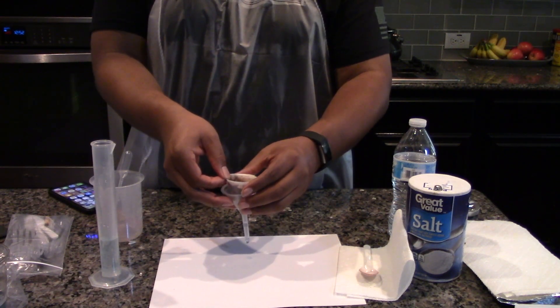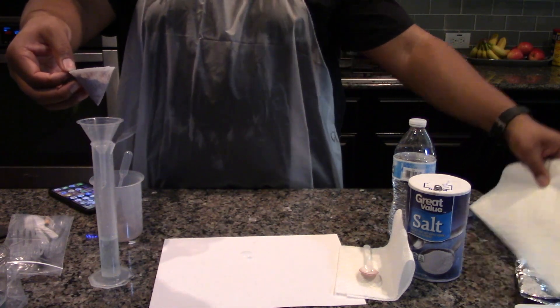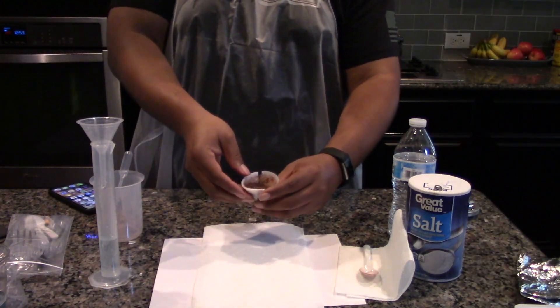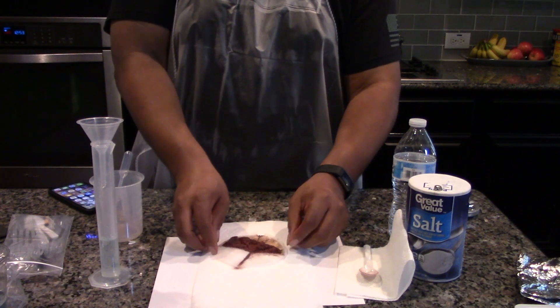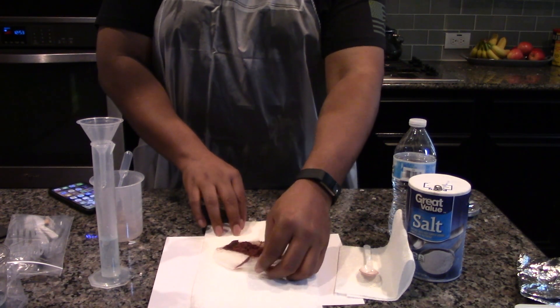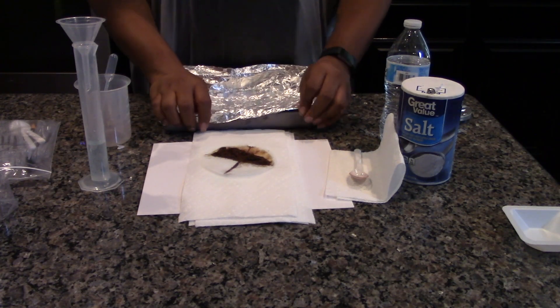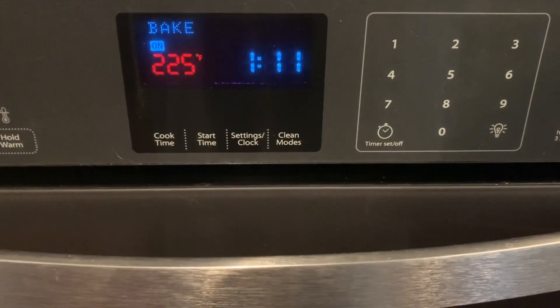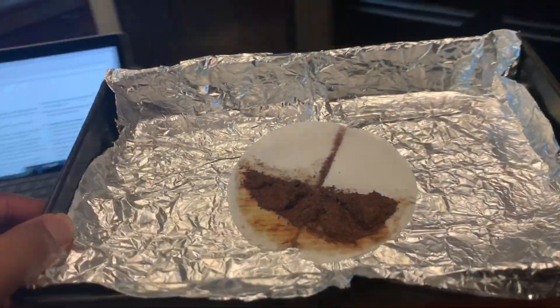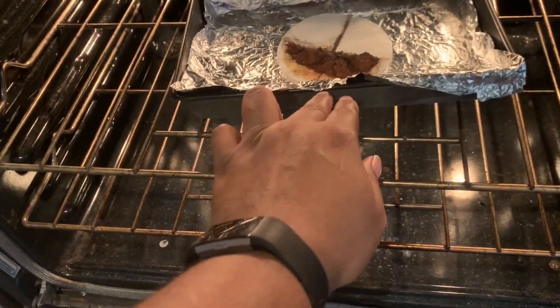Carefully remove the filter paper from the filter funnel. Unfold the filter paper and lay it flat on several layers of paper towels to assist in the drying of the copper metal. Place the filter paper on a sheet of foil, then place the foil on a cookie sheet or pie pan. Heat the copper metal and filter paper for 25 to 30 minutes to remove all the water.